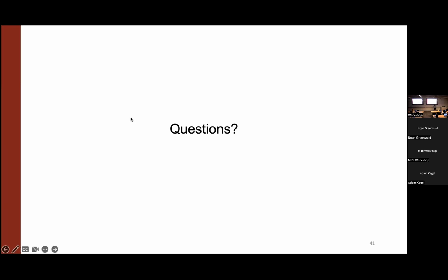There's a question online that basically asks exactly what we just talked about. What's the best way to optimally choose the K, and are there other approaches besides silhouette score? The consensus from the experts in the room is that we have yet to find an approach, in MIBI data, CyTOF data, or single-cell RNA sequencing data, where you can reliably just trust the output of the automated clustering. Given that, it's unsatisfying, but more practical to just pick the number based on manual expert inspection right from the beginning, rather than hope it gets it right and then end up changing it anyway.